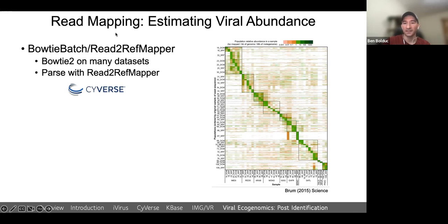And you can generate plots, not exactly like this, but you will get the heat map and tables, the heat map that represents basically this table. I don't think I put the example in here, but I do have one that has like 6 or 7 data sets and only about 10 genomes in it, so it doesn't look as fancy or flashy as this.